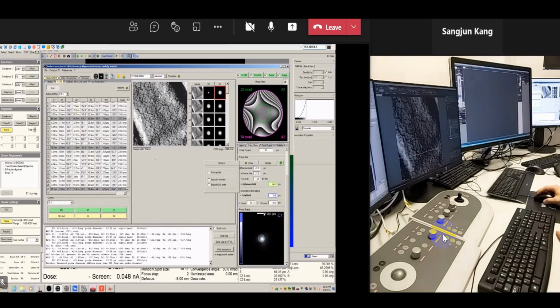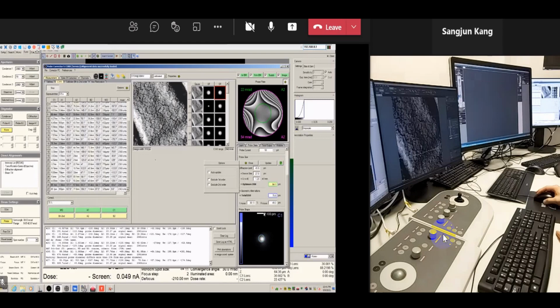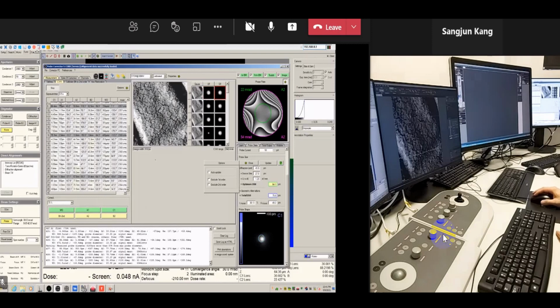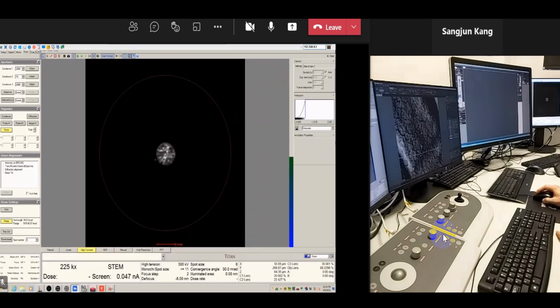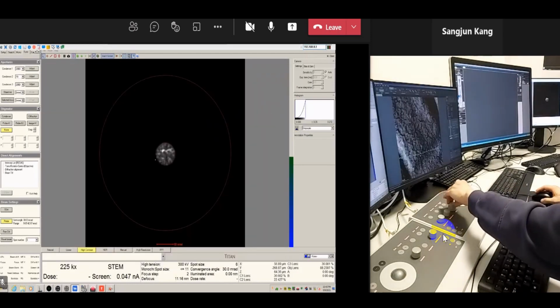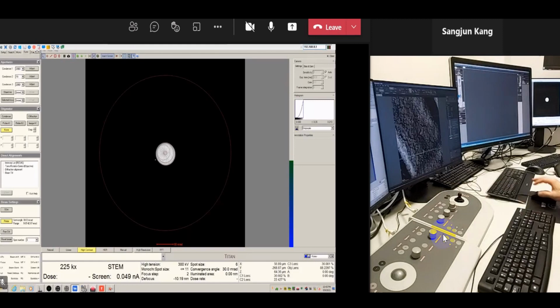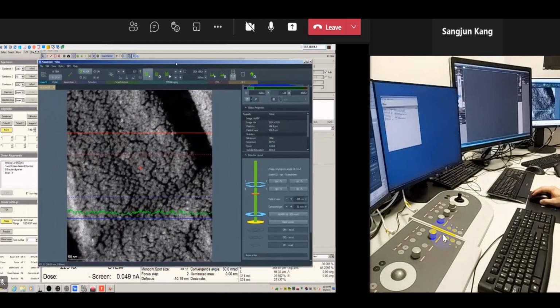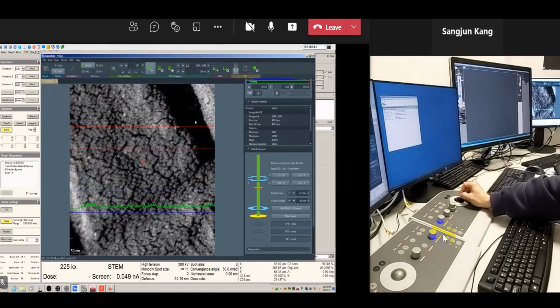Okay, I think it will be okay. I think this is going to be okay for today. Okay. Yeah, let's see the Ronchigram. Yeah, good. So maybe we go somewhere. Yeah. We already tuned the probe nicely, so I use the Ronchigram in this monitor.